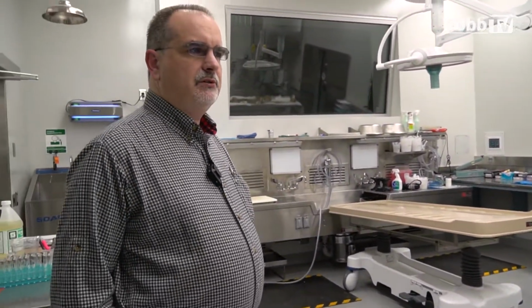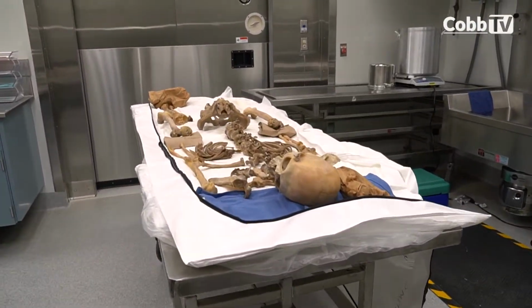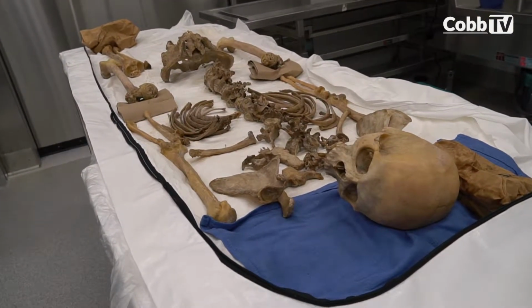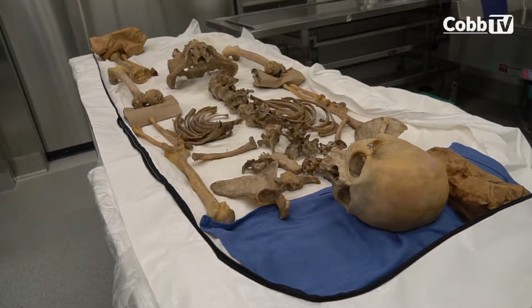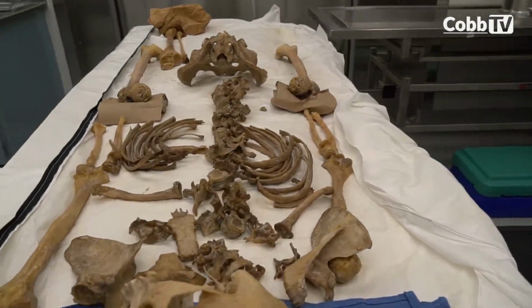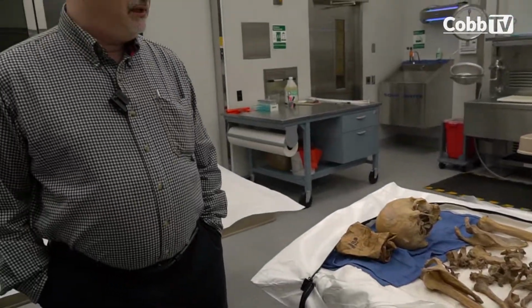And our special autopsy room is used for cases which may be infectious, which may be decomposed, but we also have a station in here to work with skeletonized remains or neuropathology. And as you can see, working right now on a skeletonized set of remains. Obviously, not all of the bones are here, but a fair amount of them are. And so we will be determining the height and the sex and the race of this decedent based on skeletal characteristics.